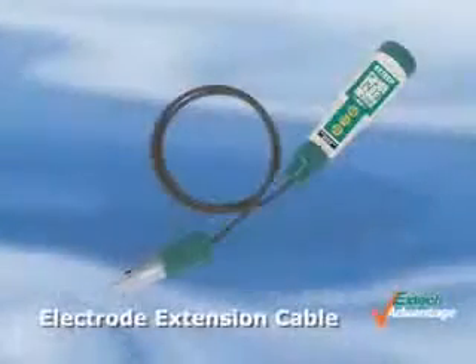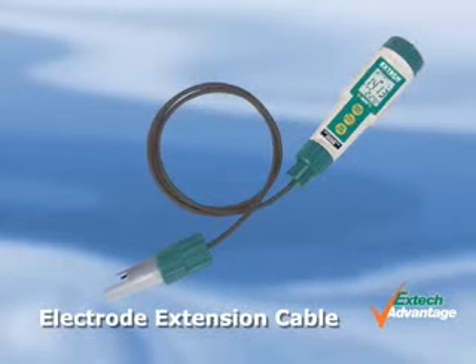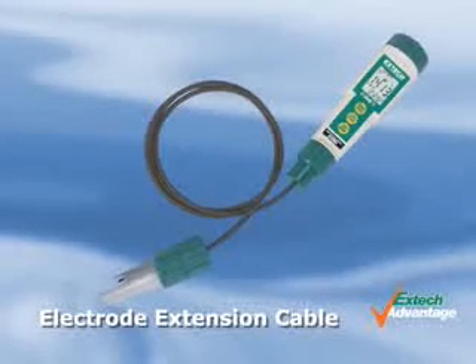An optional extension cable of one meter or five meters allows for remote measurements, facilitating measuring in difficult-to-reach areas.